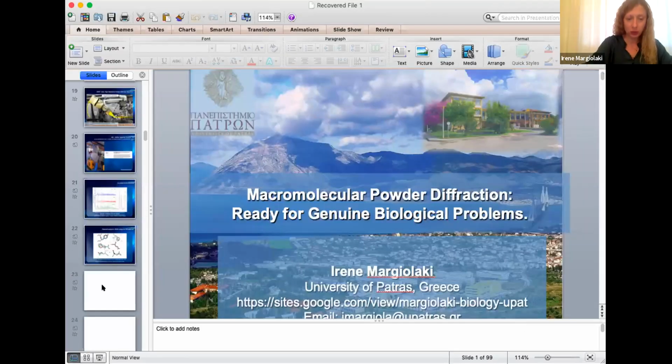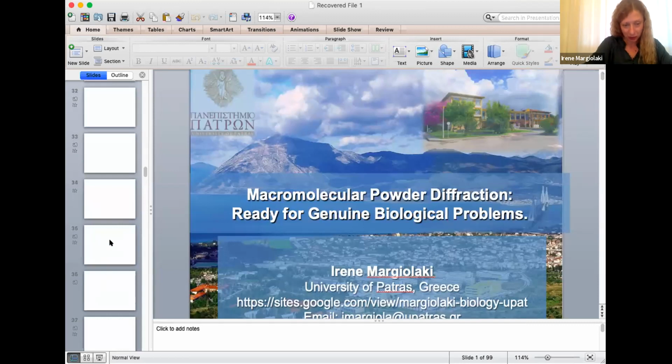So while I'm reopening my presentation, I will try to describe. There are 3 main forms of insulin: monomeric, dimeric, or hexameric. The active form is the monomer, but many drugs have dimers or hexamers. So there is a constant search towards different conformations that could be used as drugs, to say it simply. I hope you can see it now.